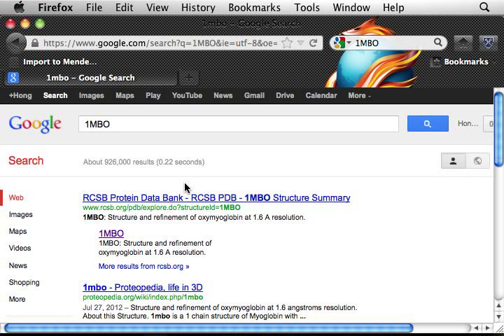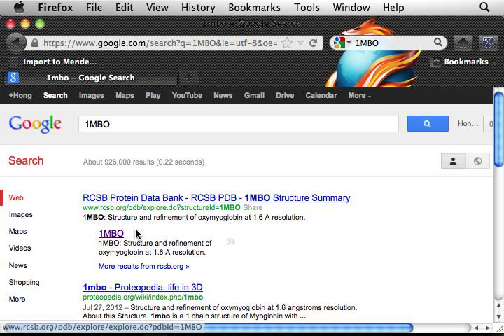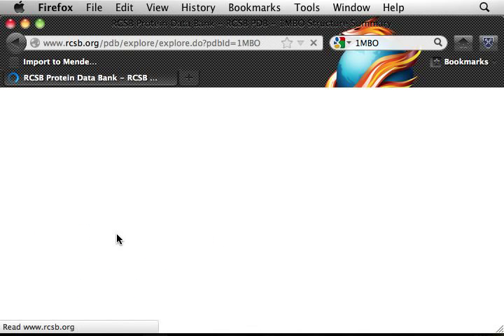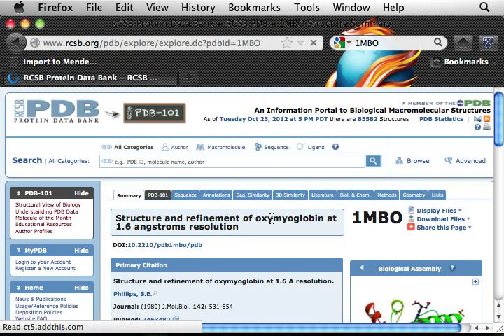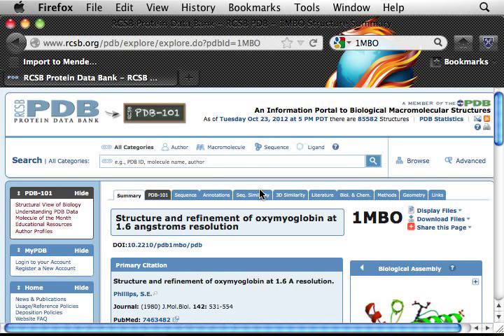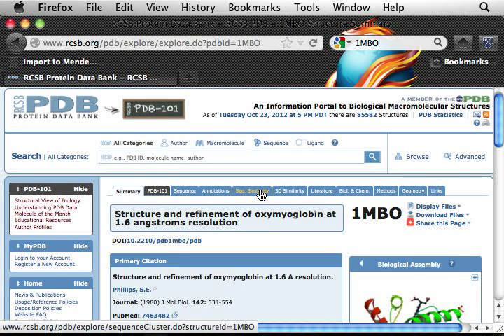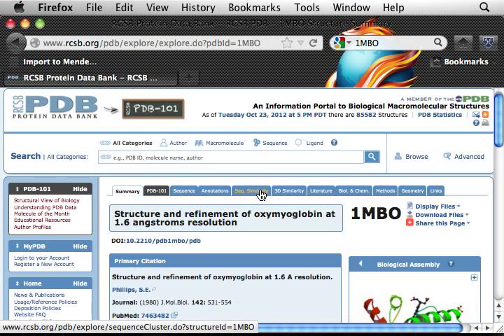It turns out if you Google 1MBO, Google actually sends you directly to the PDB database. Click the 1MBO link, and it takes you directly to the 1MBO data PDB file.